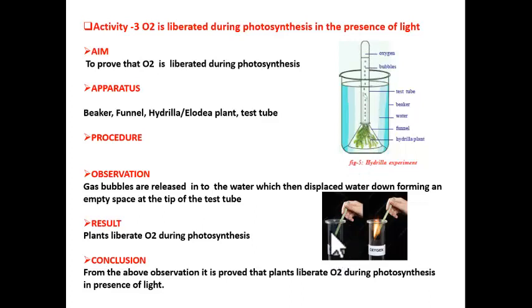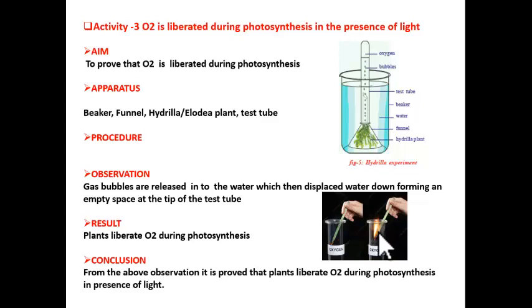Then take a burning match stick and put it at the mouth of the test tube. We find the flame bursting out, which confirms that the collected gas is oxygen.